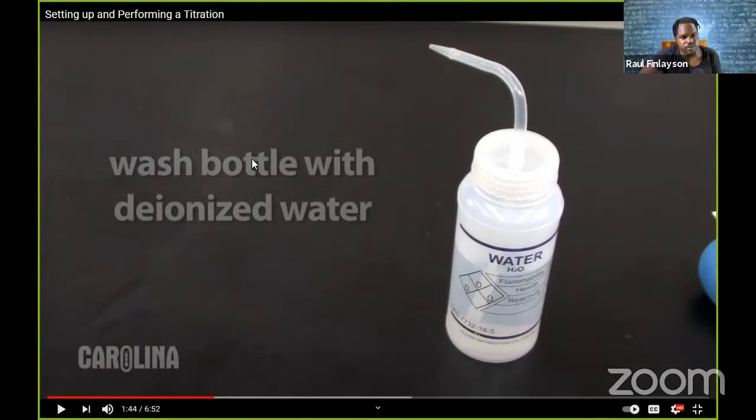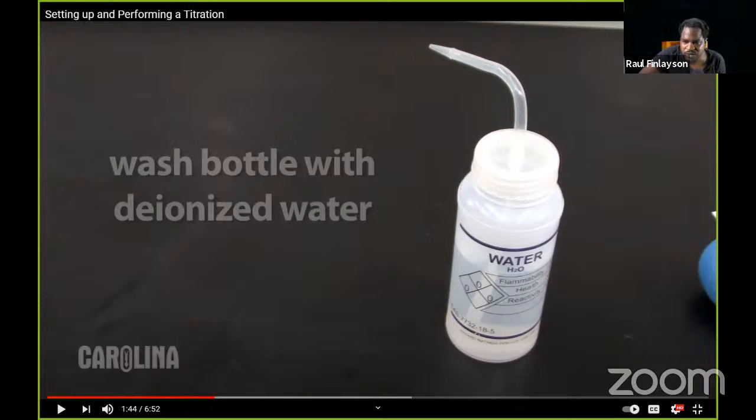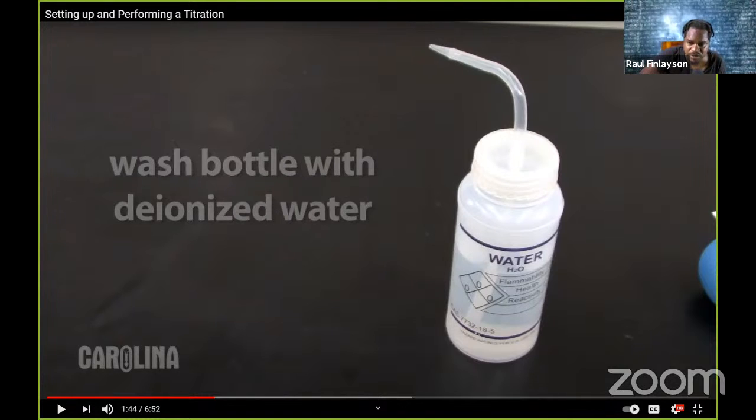You see the flask helps minimize spillage. That's going to be a precaution. And see the next precaution here: a wash bottle with deionized water. So you see all of them things there, write them in, because those are things you're going to get marks for. So write that in as a precaution. We never write the source of error. All right, so sources of error.